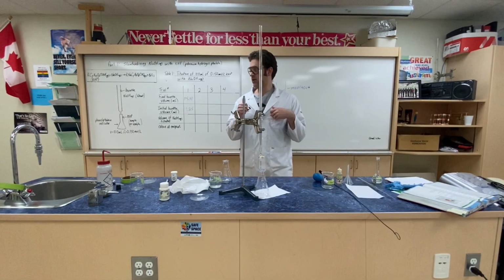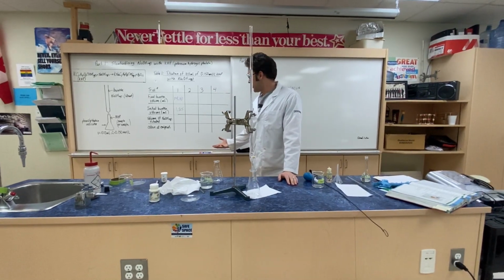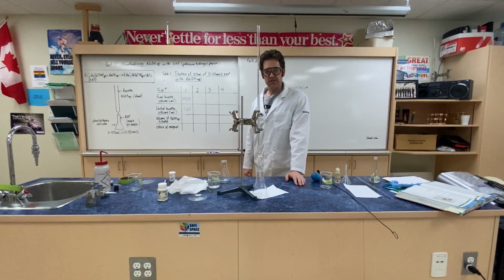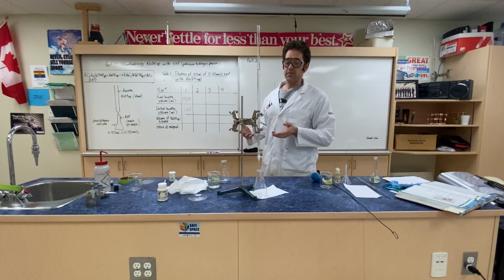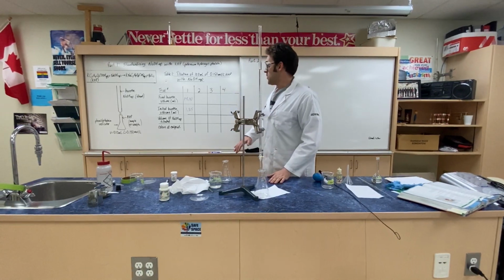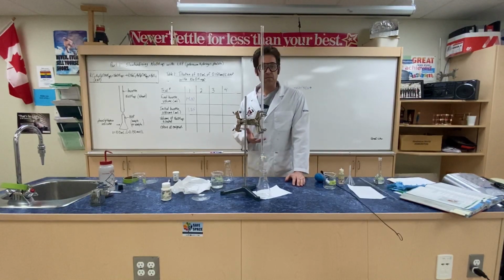Boom, tag out. So Zdog did a great job. We got, I don't know, 13-ish milliliters used. Oh, that's spoiler alert. You guys got to figure that out. So we have to do multiple trials to make sure we have a nice average. So we need to try and get multiple volumes of sodium hydroxide that are the same before we decide to shut her down.